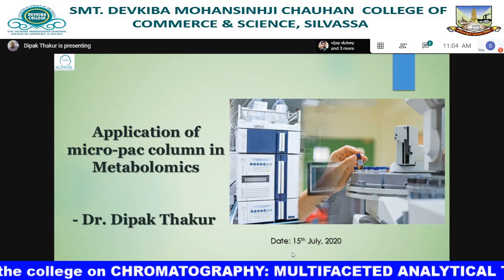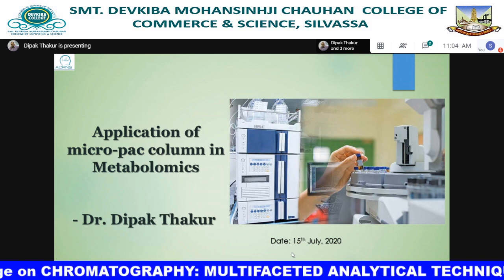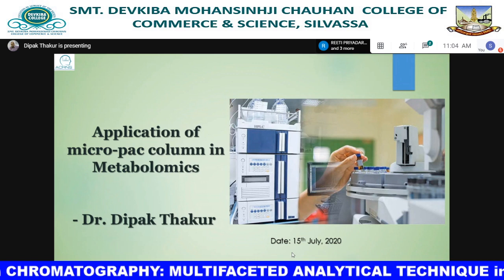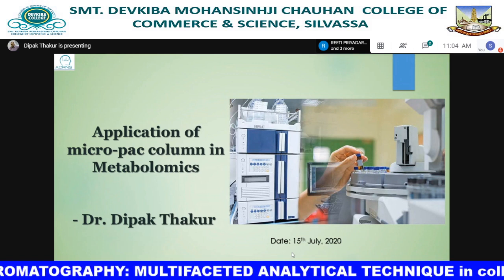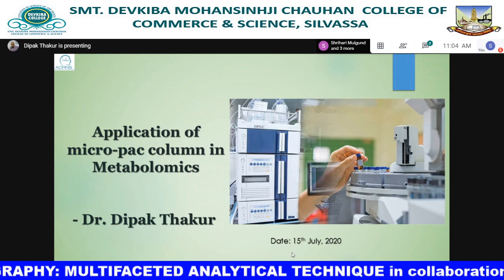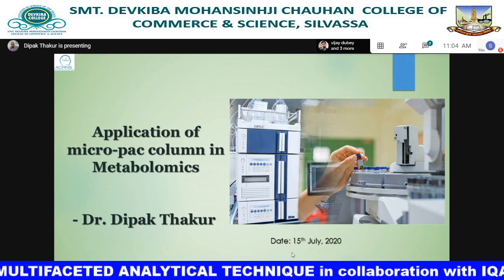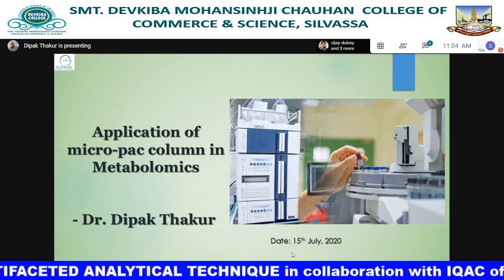Among these components, column plays a very important role as it is called the heart of HPLC, where separation of components of a sample, different analytes which are present in the sample, happens in the column.